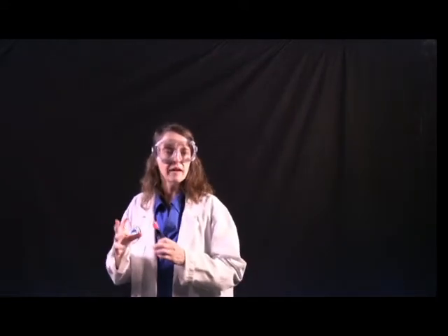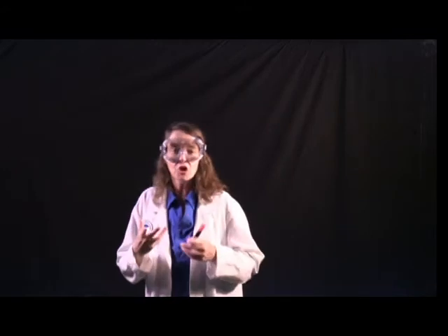Welcome to Chemistry Lab. Today's lab, crystal violet, a kinetics study. We're going to be looking at crystal violet, which is a kind of large organic compound, and its reaction with sodium hydroxide. It's a relatively slow reaction. We can watch it over time and determine the kinetics of crystal violet in this reaction.